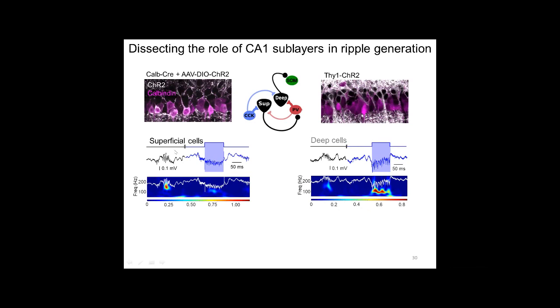We can use these to compare the synthetic ripples with the spontaneous ripples, recording in the same channel. If you would like to learn more about the many things you can do with these tools, you can read some previous papers that describe the technology and use it to extract information.